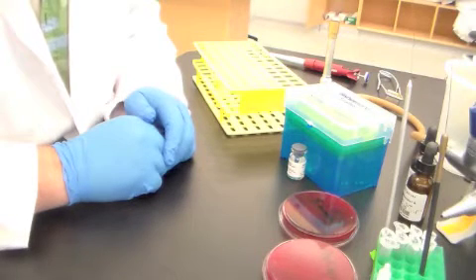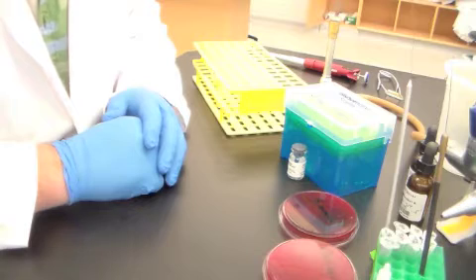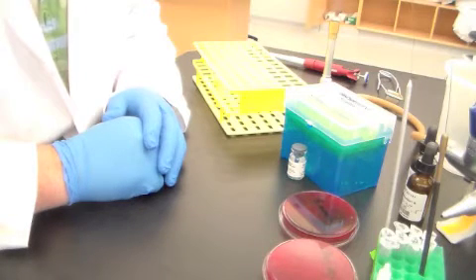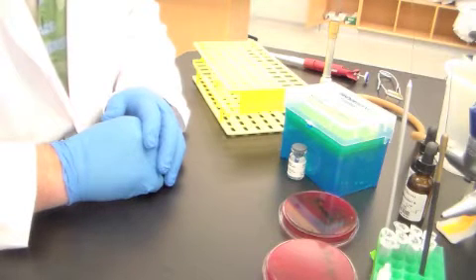If you still do not have one of the organisms testing positive, that is giving a clot, by 1 hour, just leave them in the water bath, and myself and the TAs will take them out later and put them in the refrigerator, and you can see the results when you come back for the next lab.